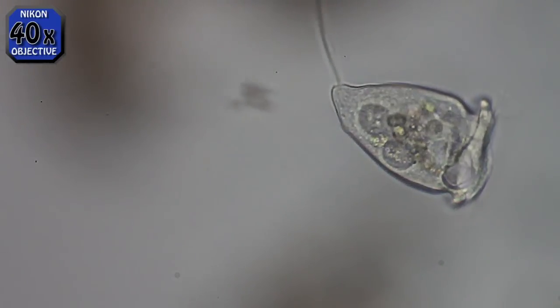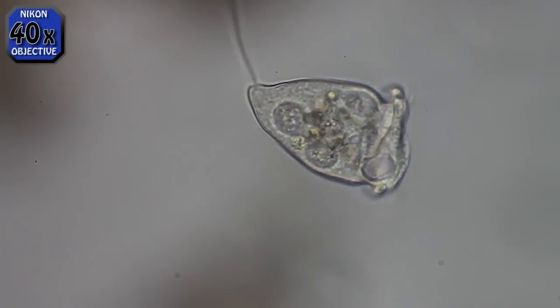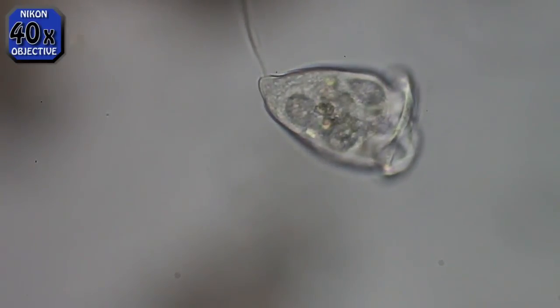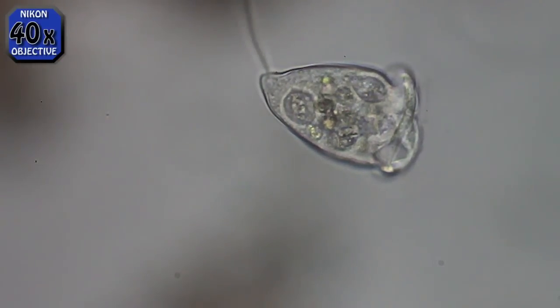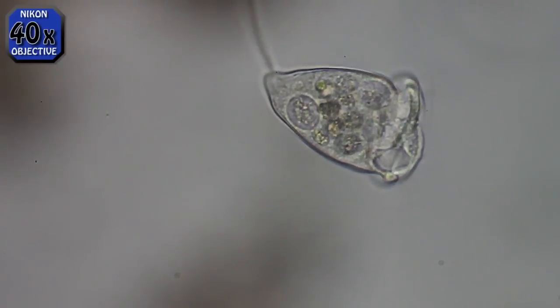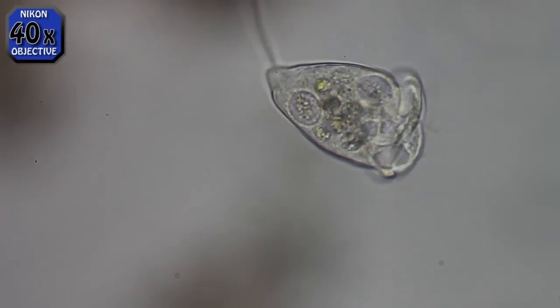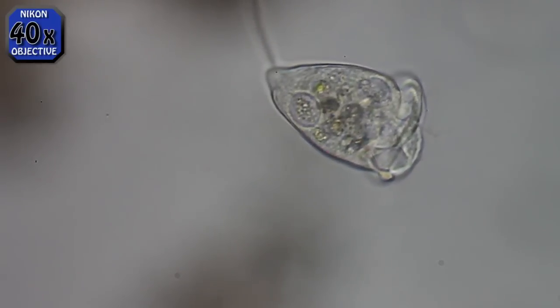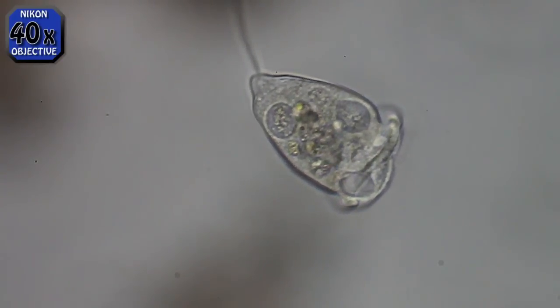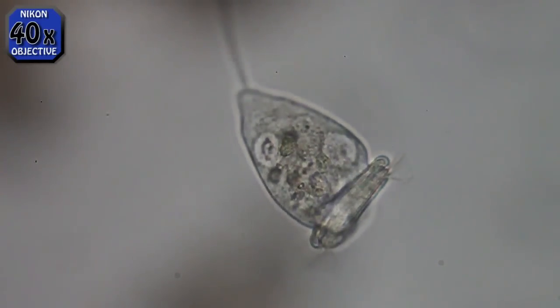This is the first time I've caught this, so I'm excited. I guess the stuff towards the center — the smaller things there — must be nuclei, macronuclei maybe. Other organelles that I don't know the name of. I should have had the phase contrast condenser in place so I could use oblique lighting on this. But still, I'm liking the quality I see here.